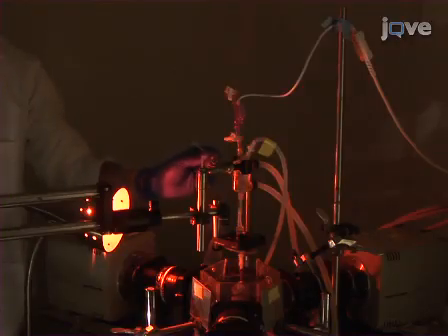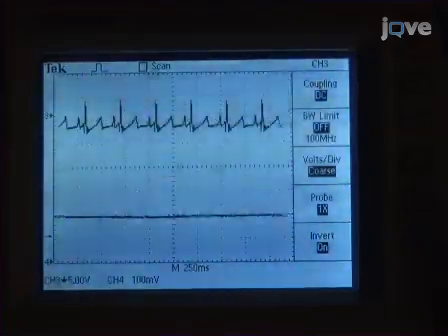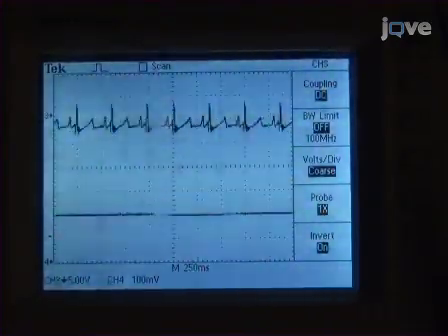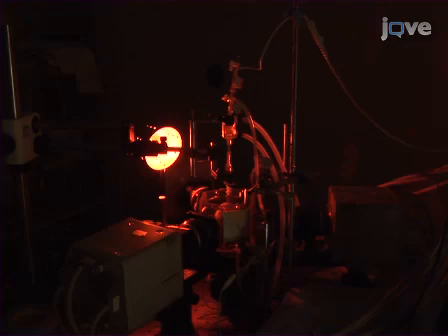Turn off the room light and slowly inject the light-sensitive blebistatin stock solution through the injection port in the air bubble trapper located above the cannula to reach a concentration of 10 micromolar blebistatin. Slowly inject 0.1 milliliters blebistatin for every bolus injection. Wait for the pressure to stabilize before the next injection.